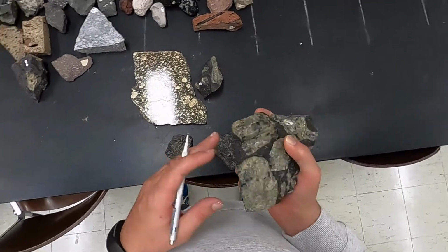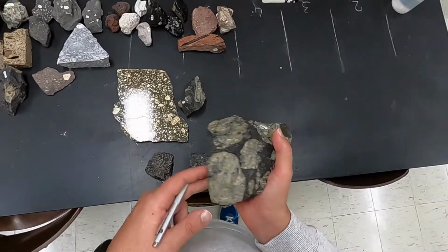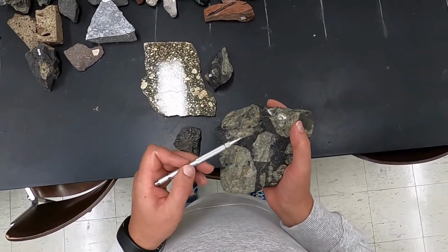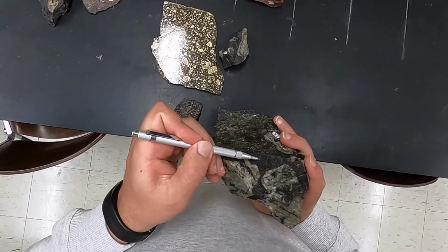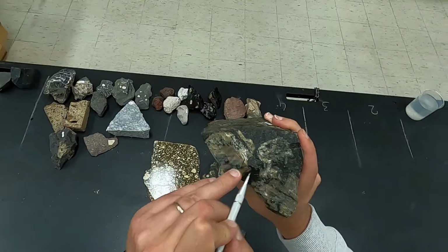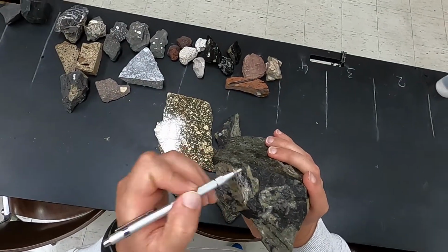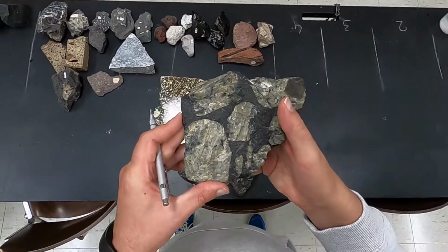So plagioclase is most likely, based also on the color of this volcanic rock, because of this microcrystalline matrix that appears to be either andesitic or basaltic in composition. I can see very small crystals here, which I don't think you will be able to see on the camera, but if I use a magnification, which we will do, you will see small, tiny, elongated crystals that represent mostly pyroxene.